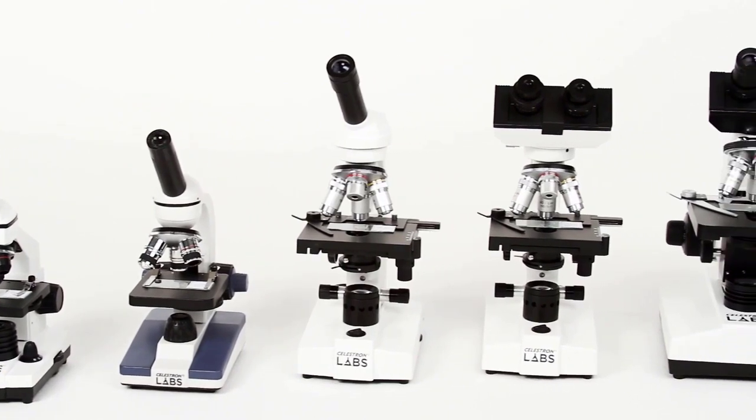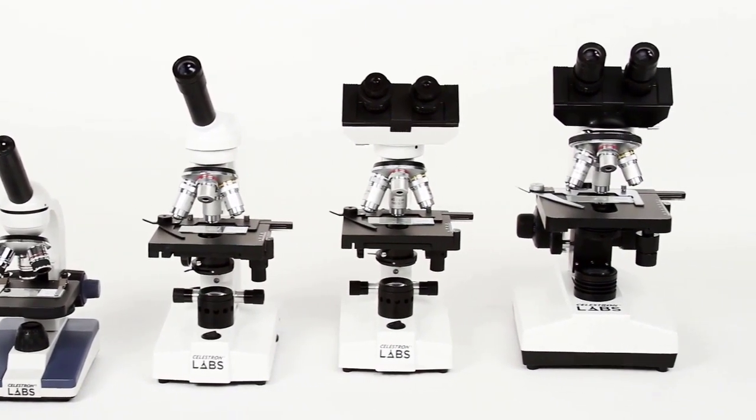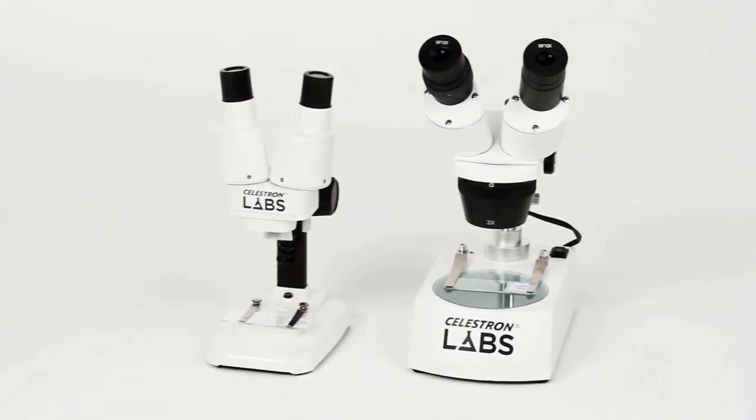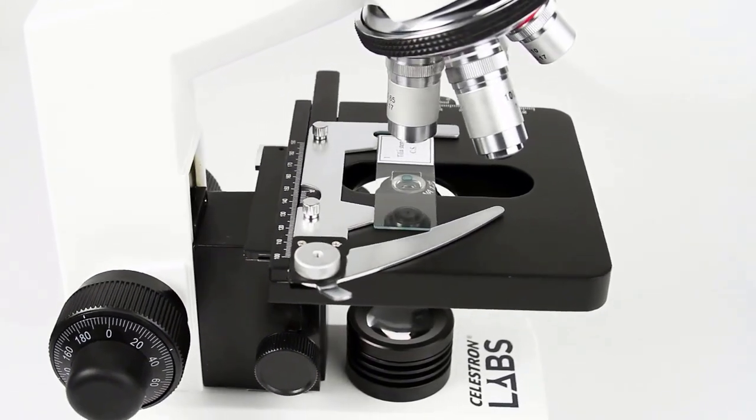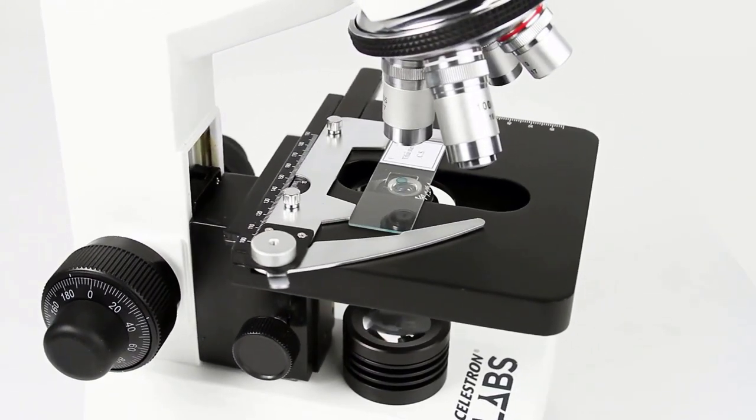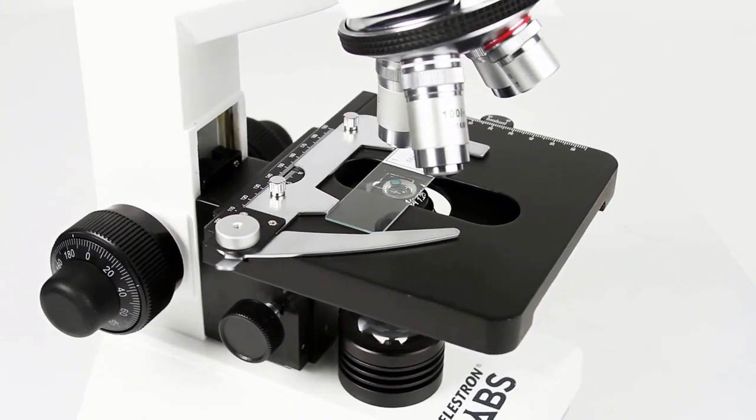Number 2. Celestron CM800 Compound Microscope. The Celestron CM800 Compound Microscope is an affordable option that nevertheless claims to be lab-grade, making it a great choice for college and university students. It comes with 10 prepared slides included out of the box, plus a sturdy all-metal build.